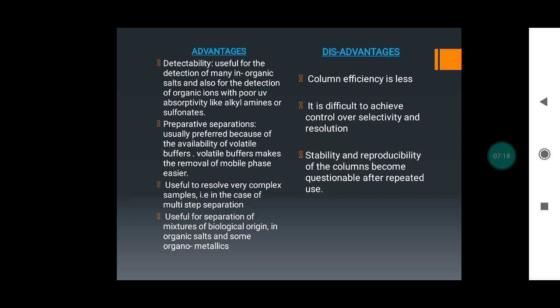Disadvantages: column efficiency is less. It is difficult to achieve control over selectivity and resolution. Stability and reproducibility of the column become questionable after repeated use.